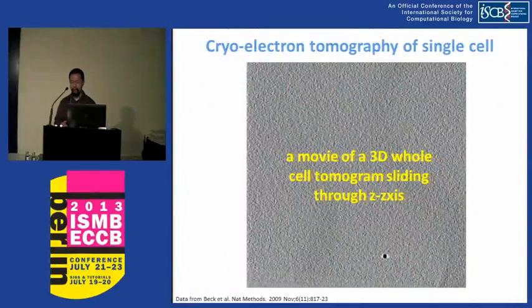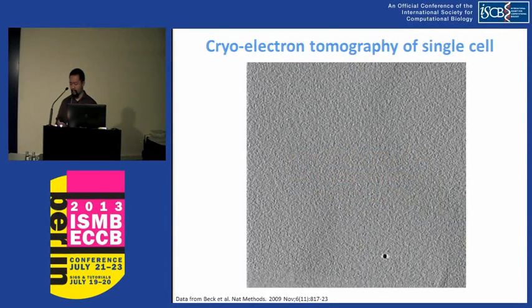And the recent advance of the whole cell cryo-electron tomography techniques allows us to capture the 3D electron density of single cells at their close to native status at about 4 nanometer resolution, which makes it possible to inspect both the structure and localization information of large macromolecular complexes inside single cells in close to native conditions.